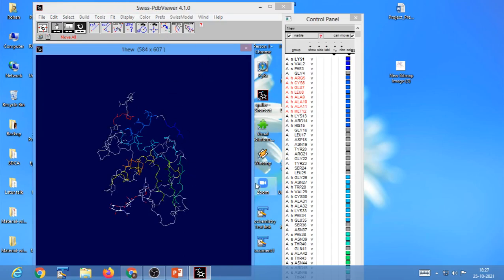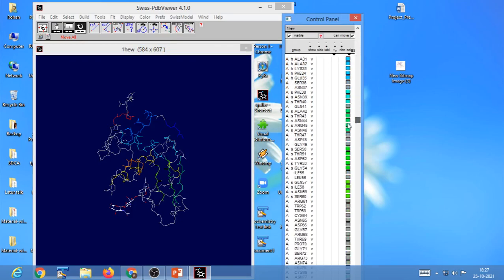Now when you color by secondary structure succession, DeepView would color helices and strands, but with this command, color would reflect the order of each structural element in the overall sequence of residues. In simpler words, DeepView colors the first element of secondary structure as violet and the last element of secondary structure in a shade of red.